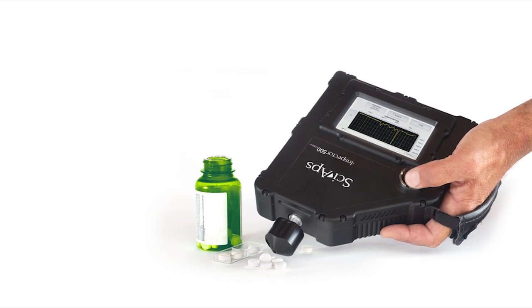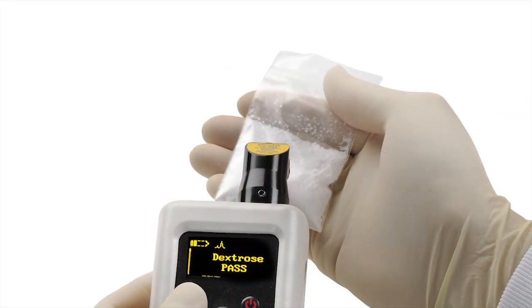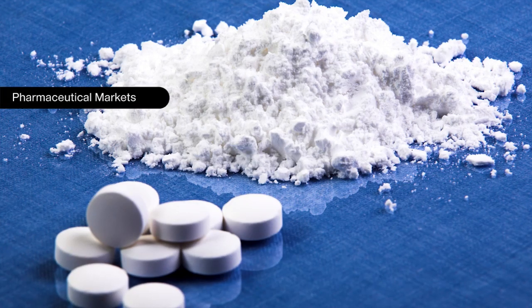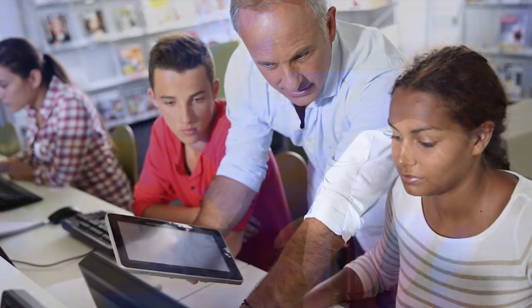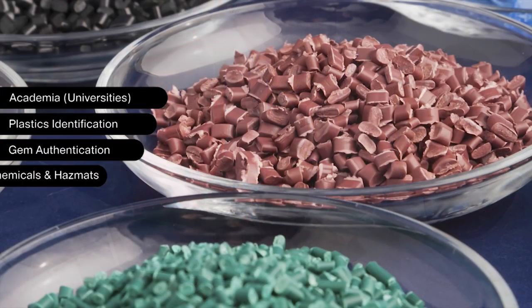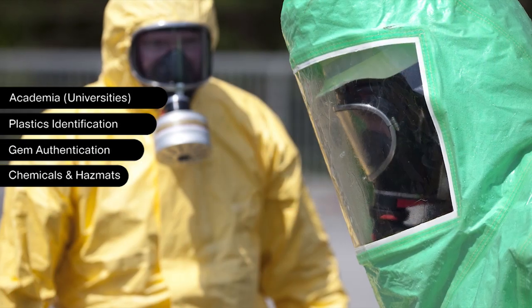The CyApps family of Raman handheld analyzers can be used in a wide variety of applications including pharmaceutical, law enforcement, crime labs, academia, plastics identification, gem authentication, chemicals, and hazmats.